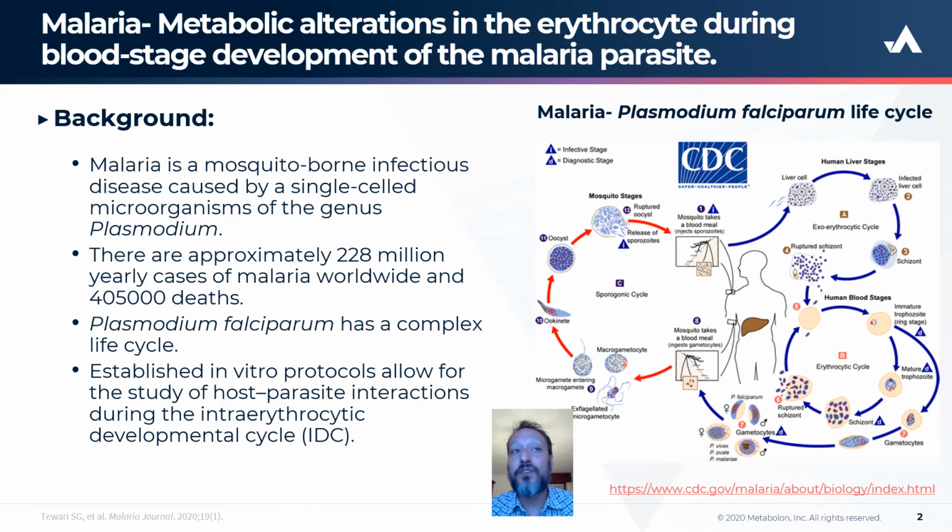Now, before showing you and discussing the results, let's go through what the researchers of this study did. So the researchers obtained Plasmodium falciparum NF54 parasites and propagated them in human erythrocytes, which they obtained through phlebotomy. They kept them at 2% hematocrit in gassed flasks. They were obviously maintained in a specific medium. And then they had to synchronize the parasites.